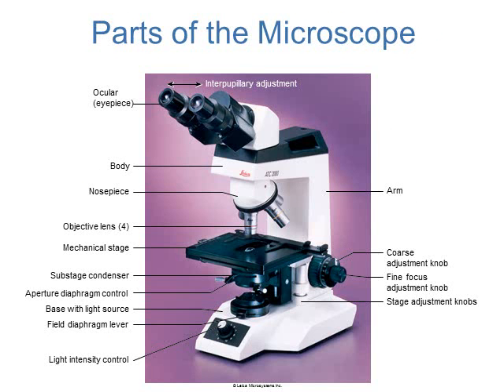In lab, we're going to be using a compound microscope, and this is what it looks like. I'm not going to go through all of the parts because you're going to learn about them in lab, but just to familiarize yourself with the different parts, I can definitely show you. So you have the 2 different types of lenses.